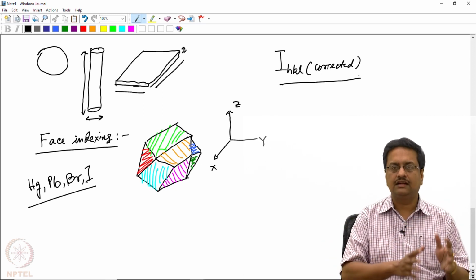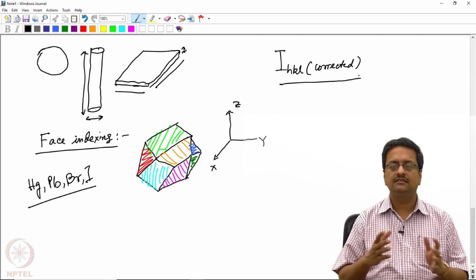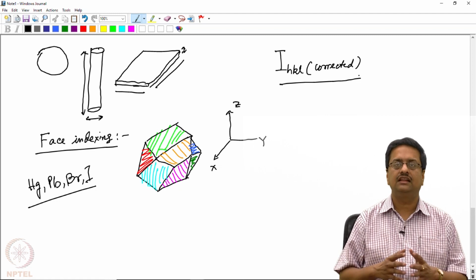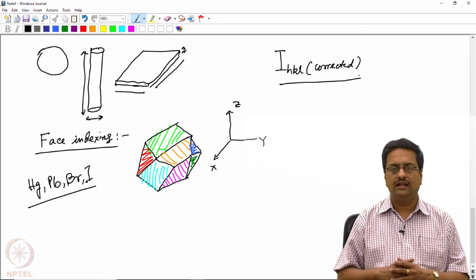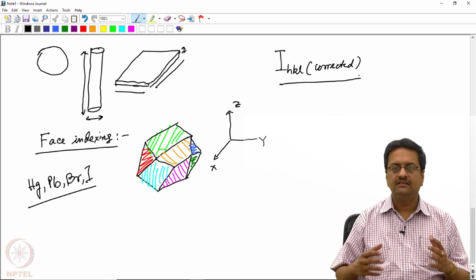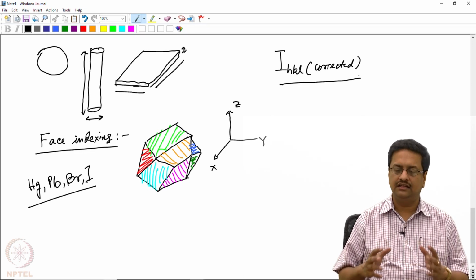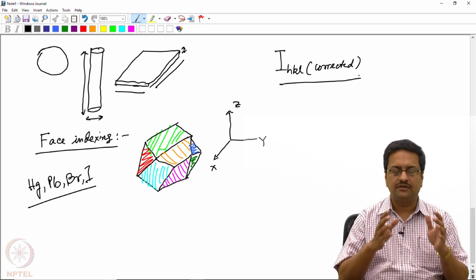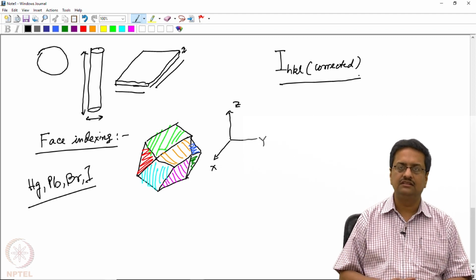So a correction for sample to detector distance is also necessary in case the data was collected with more than one detector distance during the data collection process. In general, the sample to detector distance is fixed during a data collection, and hence the correction for that detector distance is not incorporated in the calculation.